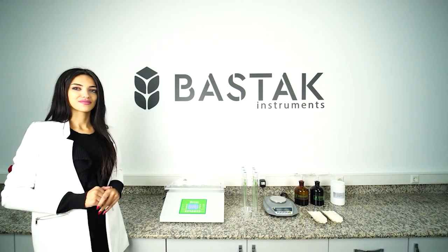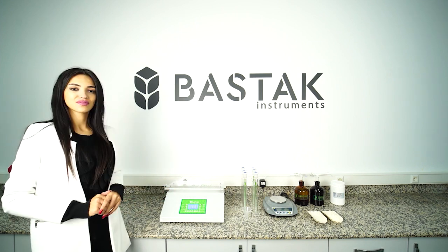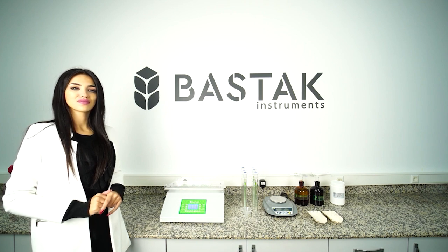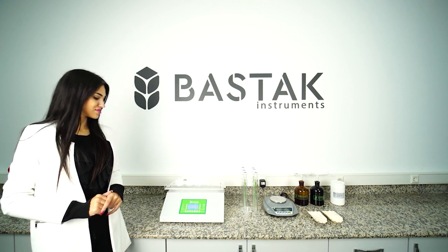Sedimentation tubes should not be removed from their place before the sedimentation device comes to a complete stop and provides an audible warning. The Bastak brand 3100 model sedimentation device is used to determine the bread-making quality of wheat and flour samples and to detect pest damage. The device can perform Zeleny sedimentation analysis and delayed sedimentation analysis.